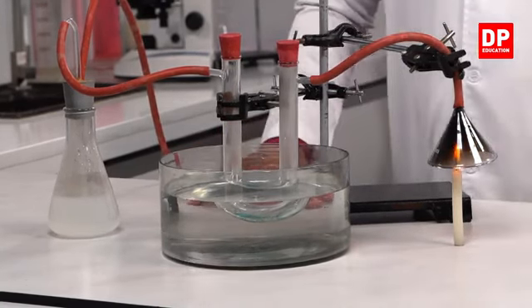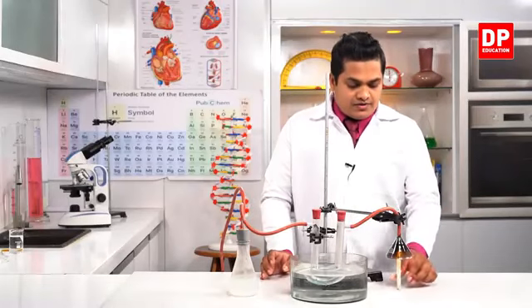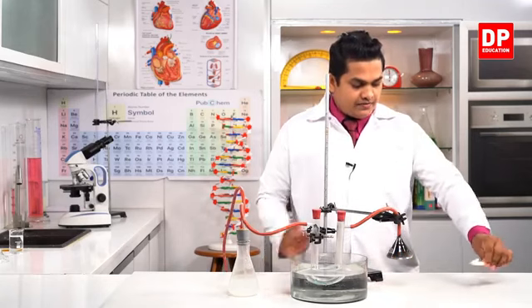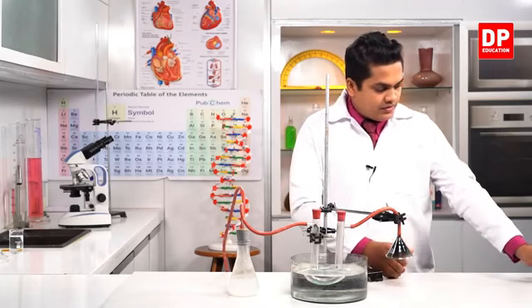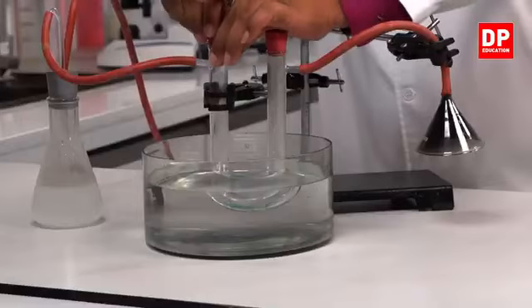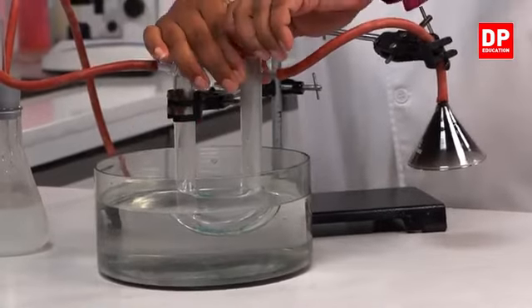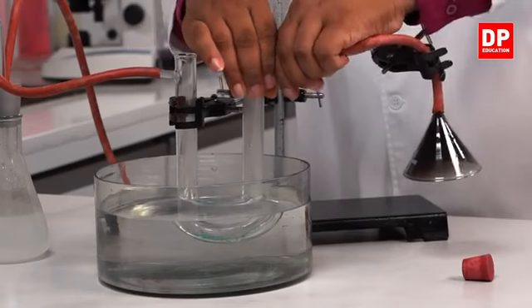So now let's see. First of all, I'll put off the flame in the candle, right? So now gently I am going to remove this setup to show the color of copper sulfate.